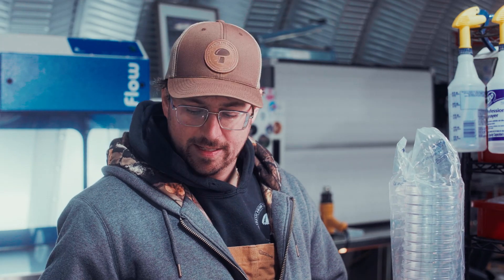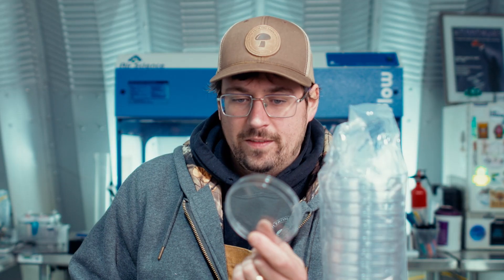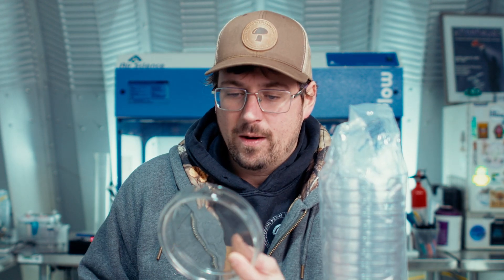Another pro of the plastic petri dish is that it's very cheap. One of these is going to cost about a penny, compared to glass dishes which run anywhere from $4 to $20, depending on the quality and quantity that you buy.